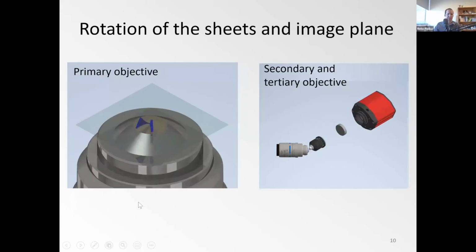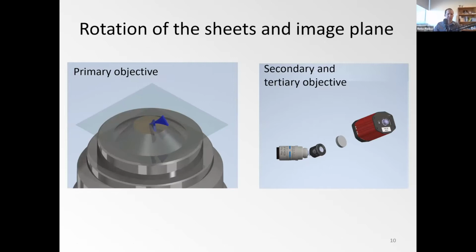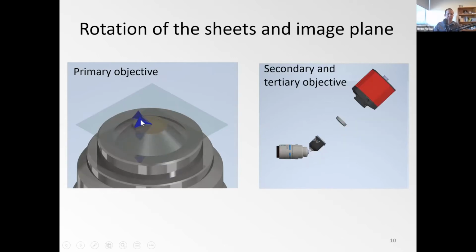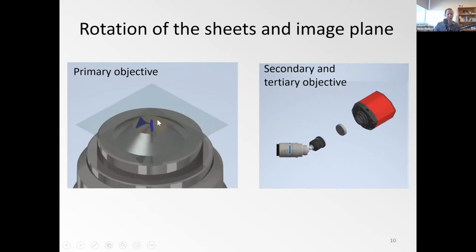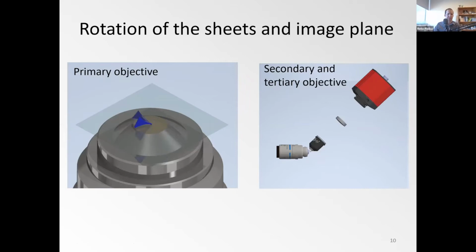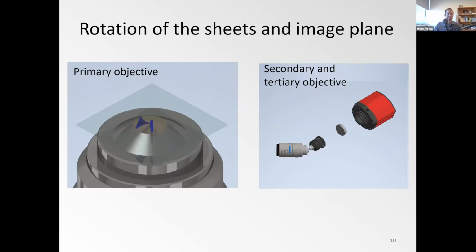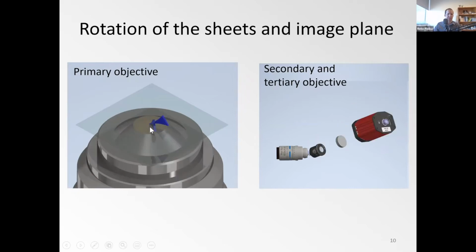Oops. There is a small detail that I have neglected, but we have to address it. So here on the left, we see the two light sheets coming out of the objective, and to acquire the SIM data under different orientations, they would azimuthally rotate. That is in principle not a hard technical challenge. You could think of a TIRF microscope with rotating illumination. There you essentially do something similar. You spin the illumination components in the pupil.